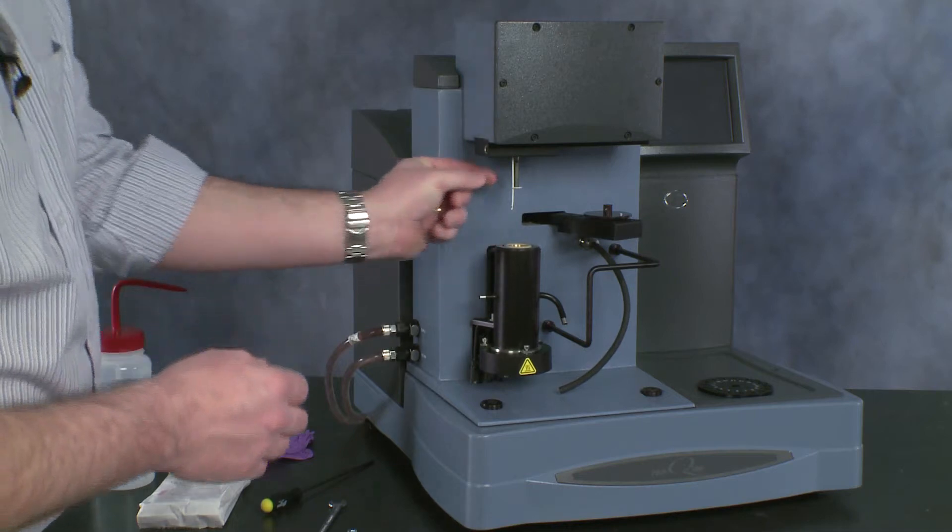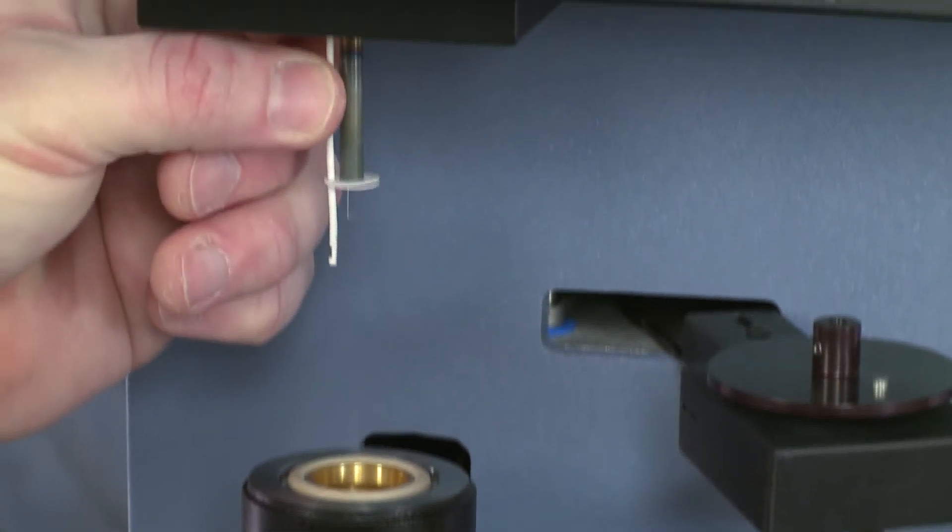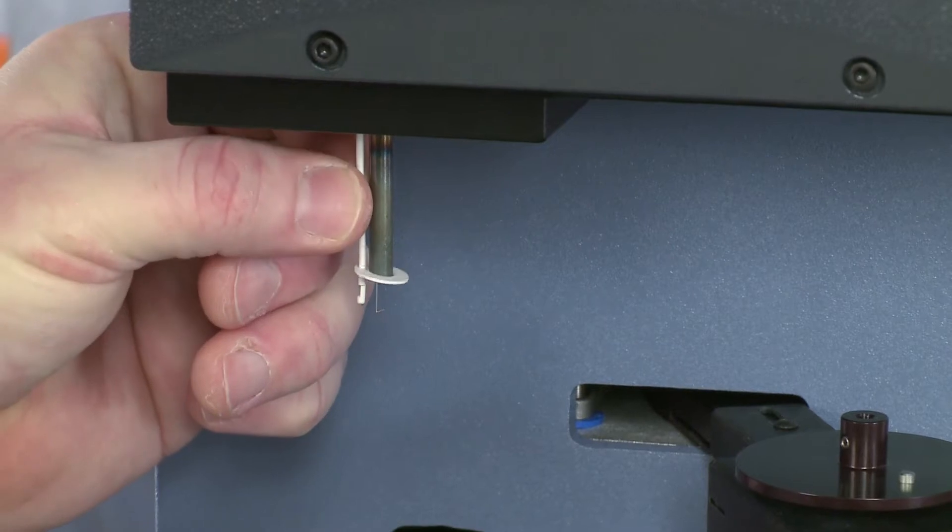To help removing the jacket, we lift the thermocouple up so that it's out of the way, remembering where it was so we can put it back in the same position afterwards.